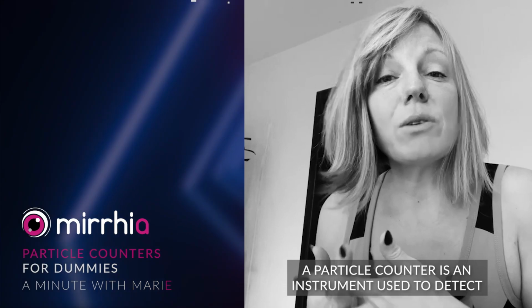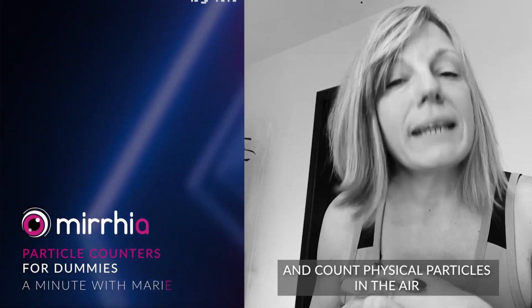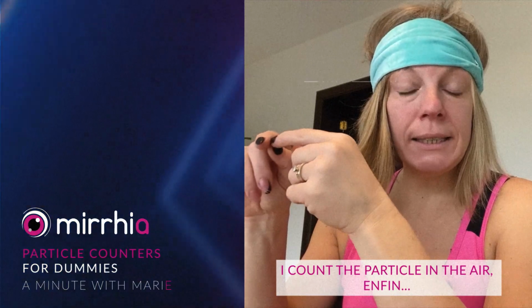A particle counter is an instrument used to detect and count physical particles in the air. Vivane, what are you doing? I count the particle in the air, enfin.